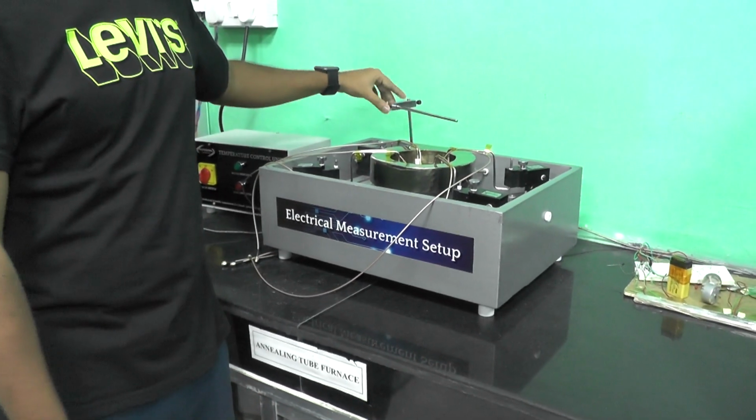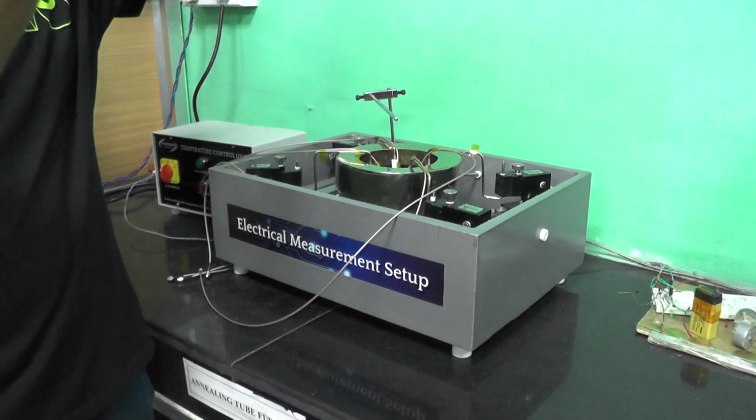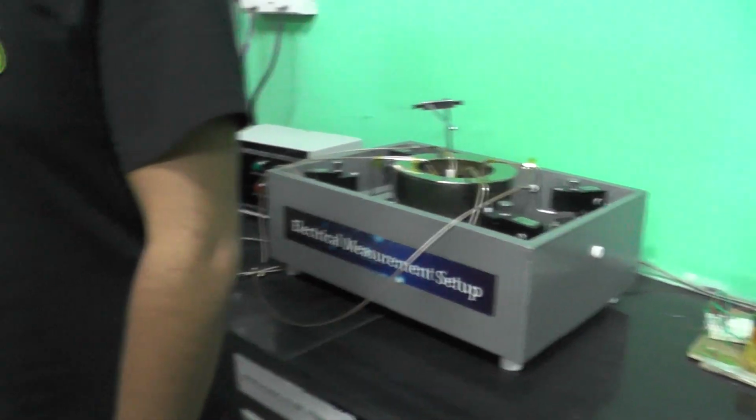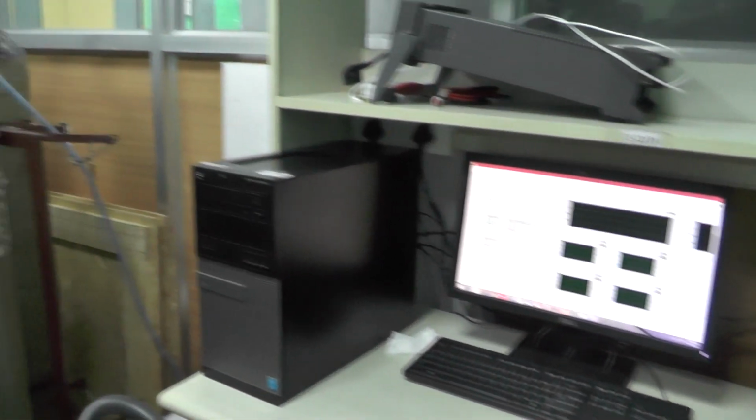For this reason, using this stand, we are connecting a thermocouple on the tip of the sheet, and we are integrating it again using this NI DAQ into our LabVIEW measurement system, and we are getting the resistance versus temperature graph for a particular sample.